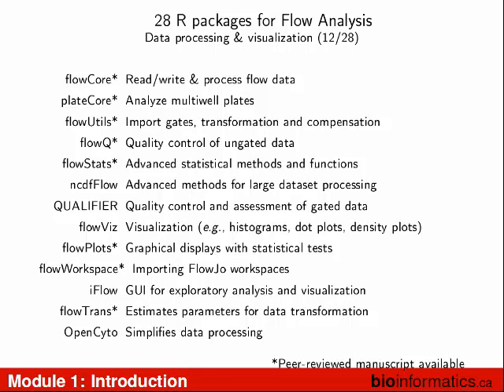FlowTrans allows people to do data transformation. OpenCyto is a new tool that Raphael's group has just developed. It basically simplifies stuff, so you don't have to do as much coding. You can use this Excel spreadsheet idea again to set all the parameters, and you just read in the spreadsheet, and then you don't have to remember all the nitty gritty stuff on how R works. You just have to tell it what you want it to do. It's a really fantastic development.